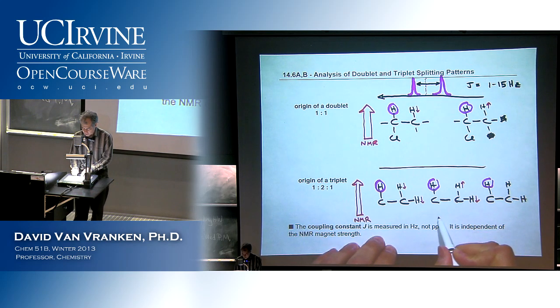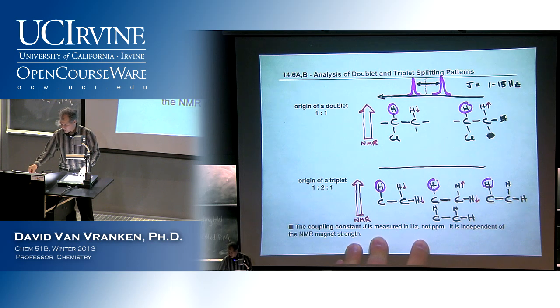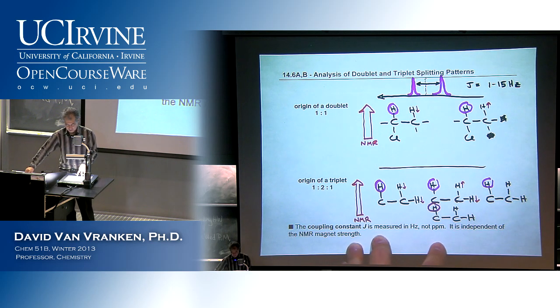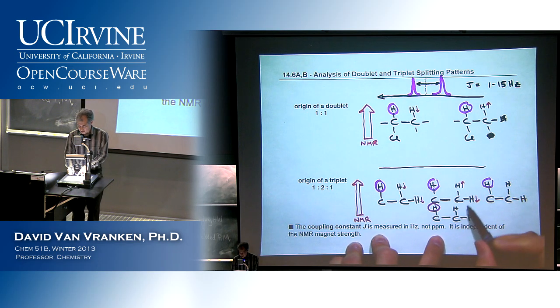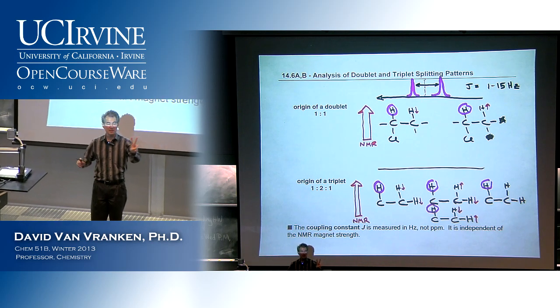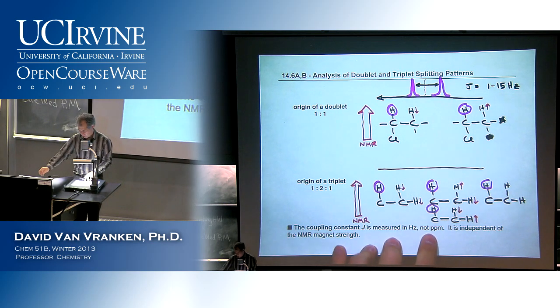So right below this molecule, I'm going to redraw that same situation. Two carbons. And it has a neighbor with two protons attached. There's two different ways to have that scenario. And we're focusing in here on this proton that I've circled because I don't want to get all confused and look at the protons that have arrows on them. And so now when I look at these possibilities, instead of having the top proton with spin up, maybe the top proton could have spin down. And then if this neighboring one on the side here has spin up, that's another way that they could cancel out. So there's two equally probable ways in which the neighboring protons can cancel each other out with their quantized spins that can only be up or down.